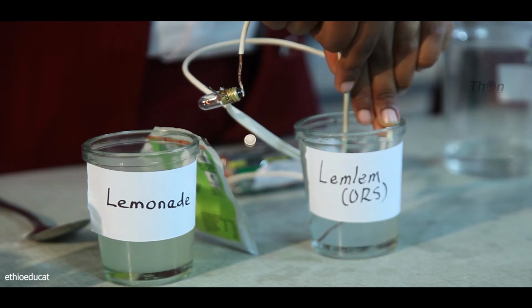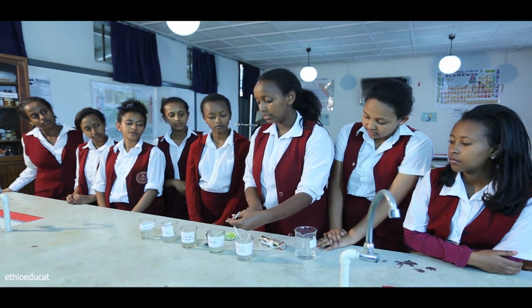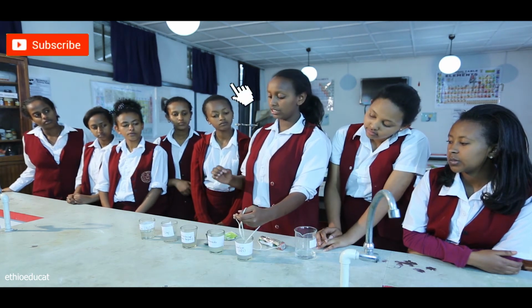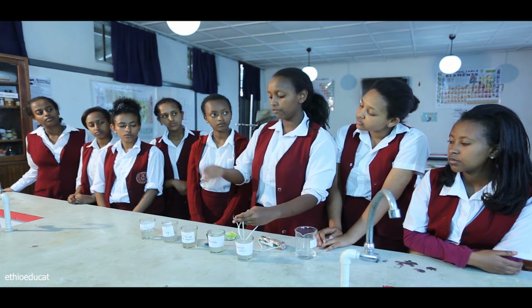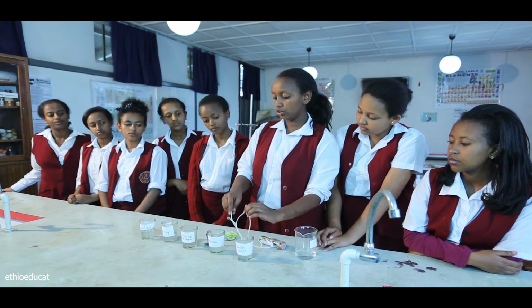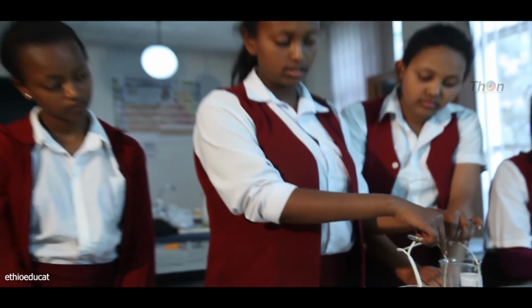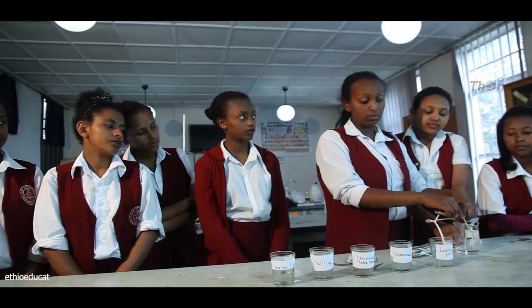So we have seen a very, very dim light. That means earlier we didn't see any light. So now that we saw a very dim light, it means if we keep on adding to the concentration of the ORS, we'll have a brighter light. So we can generalize that ORS is an electrolyte, meaning that the constituents that it has are ionically bonded.